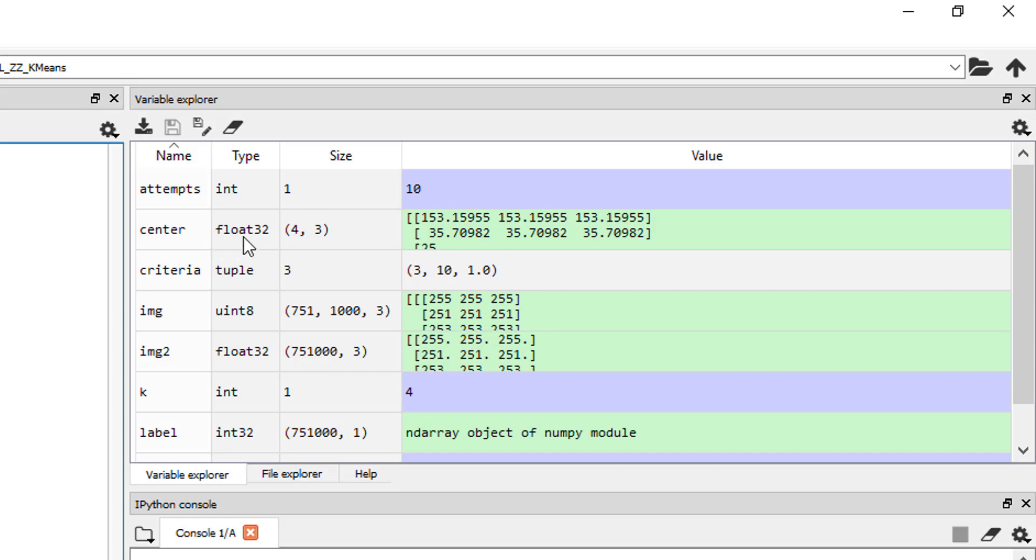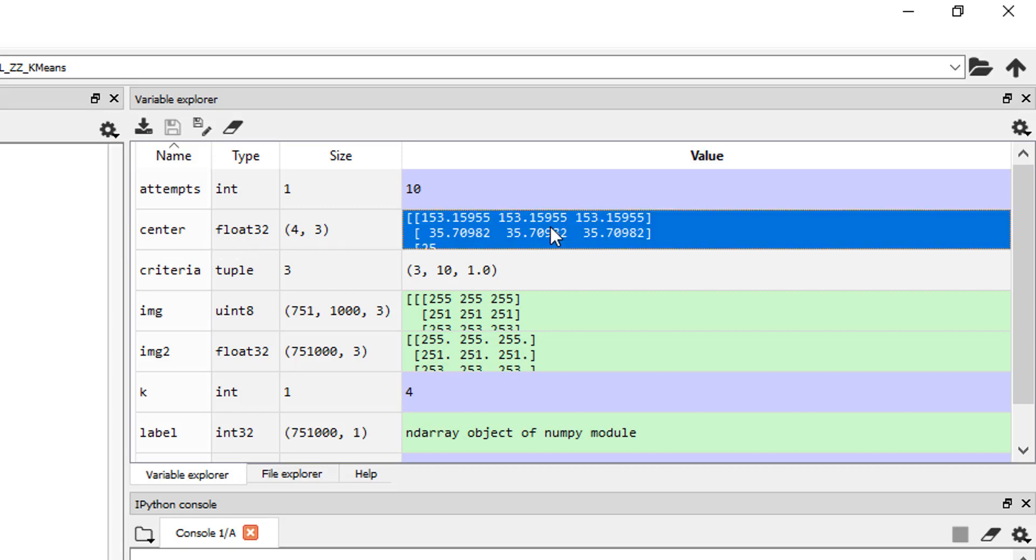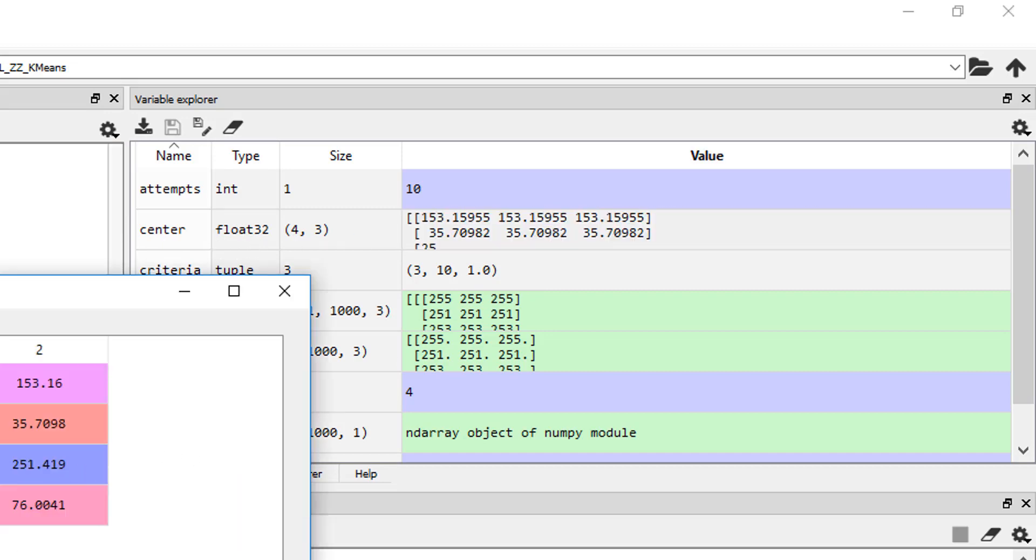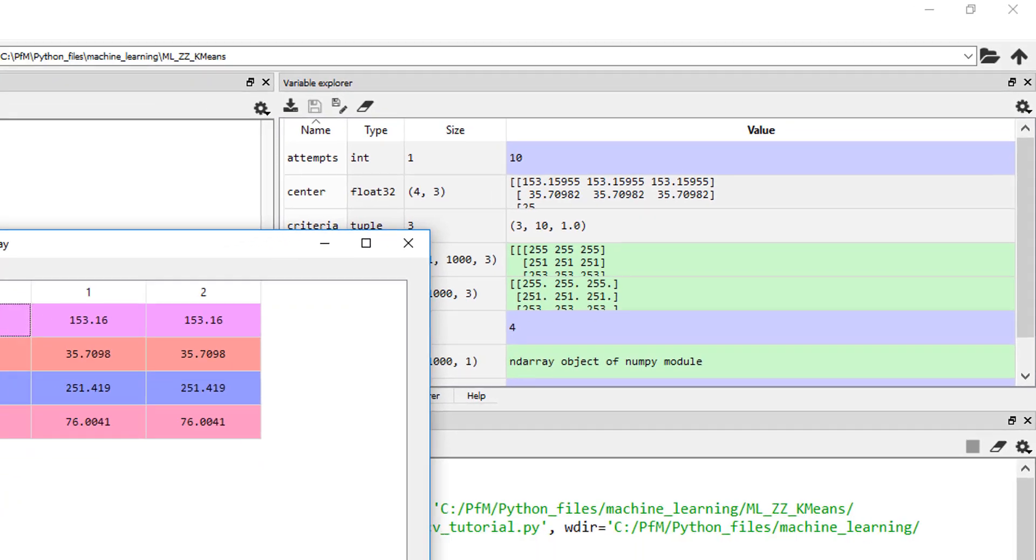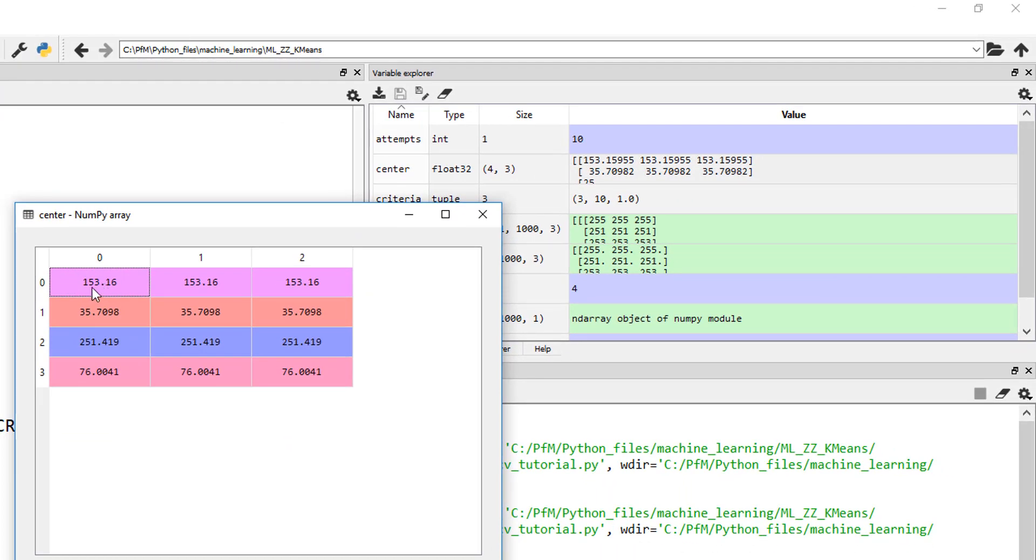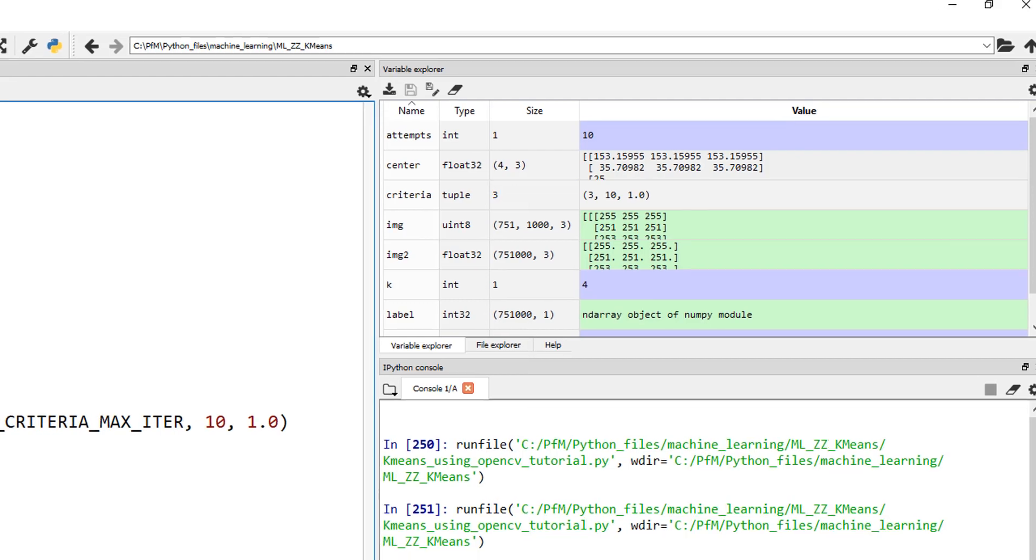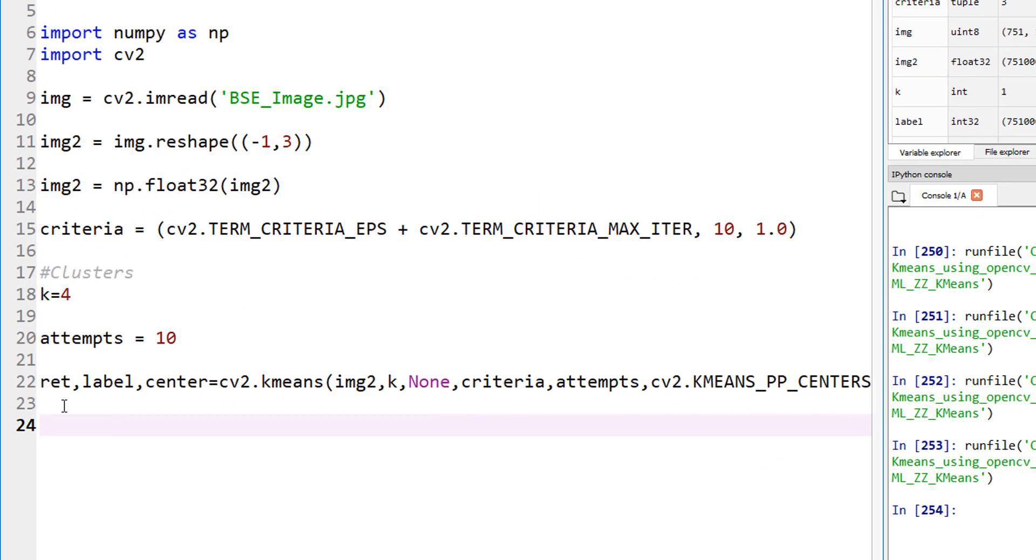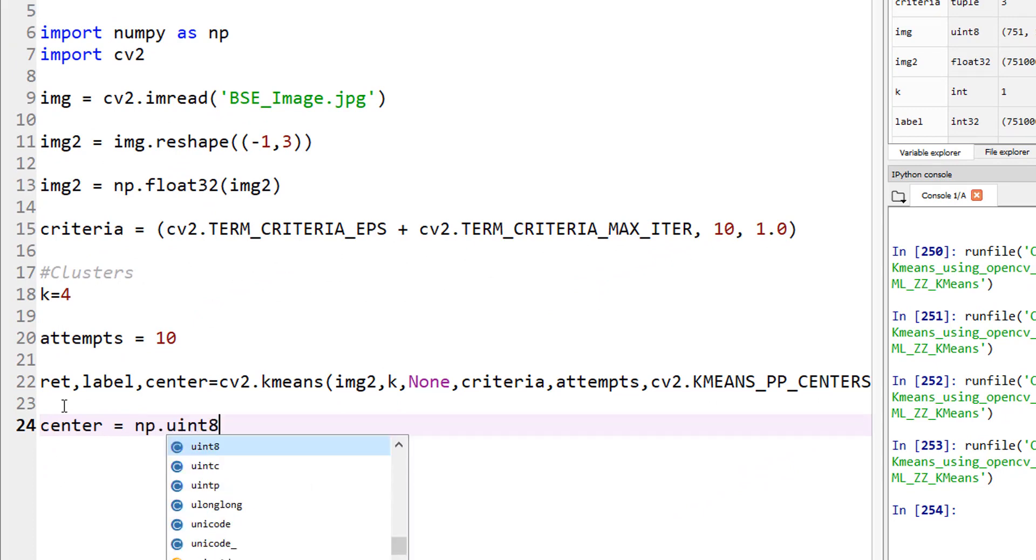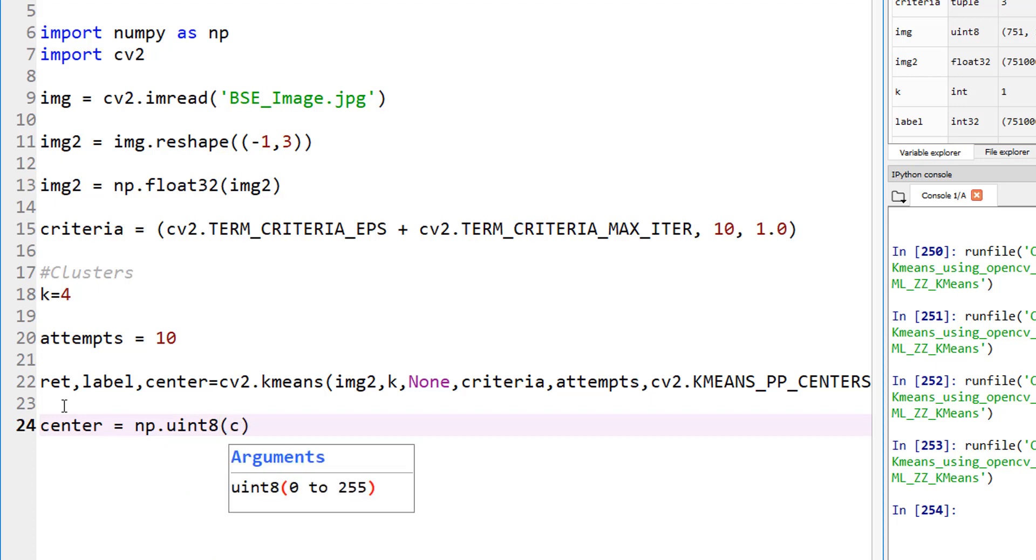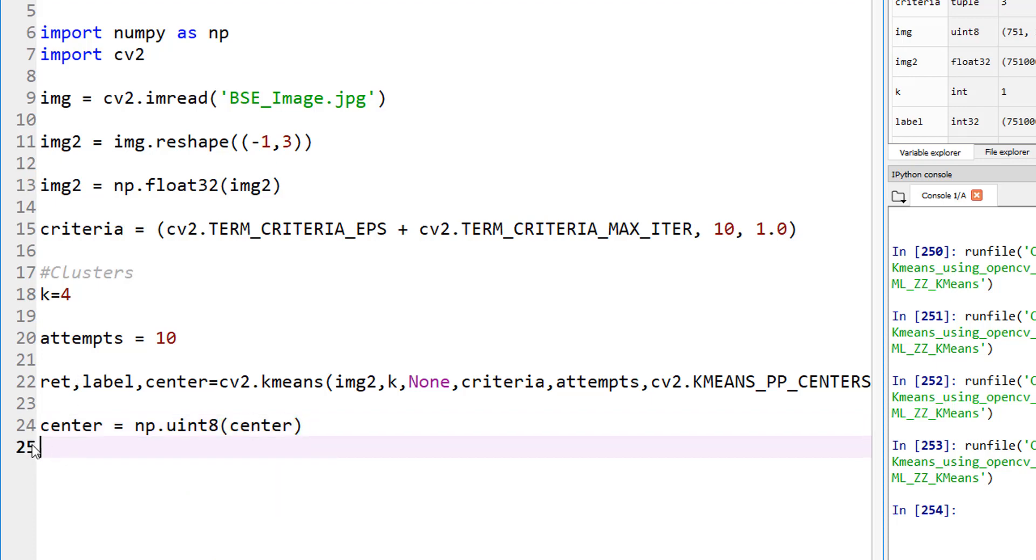The center is the center of each cluster, which gives us the average gray level of that. If you look at the center right there, it's a float32 value, which is 4 by 3. You can see the center here is 153.16, 35.70. These are the four centers of four clusters that it found. 0, 1, 2, these correspond to the three channels we have, RGB channels, and it's the same value. Let's convert that center to unsigned integer 8 so we can plot it. center equals to np.uint8, this converts the centers into unsigned integers.